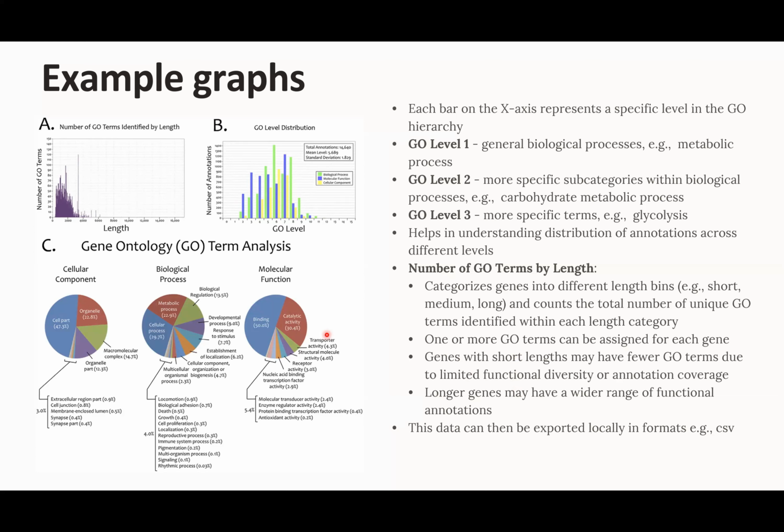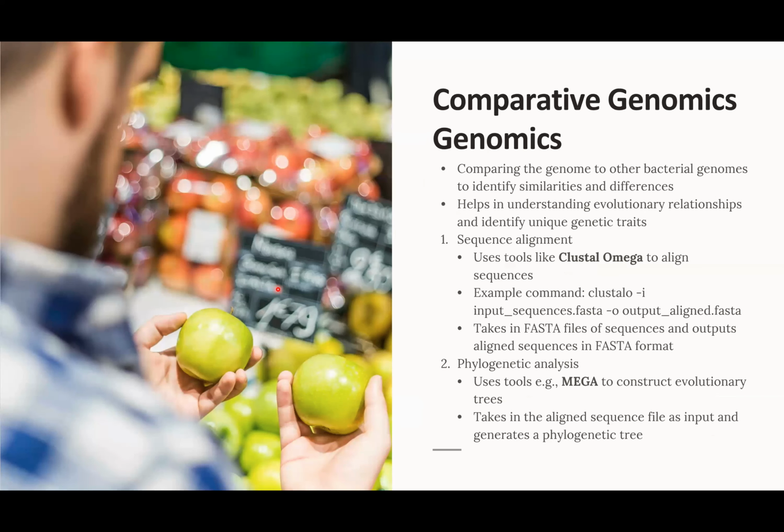And then after that, you can export your data in a format like CSV. Then you can go to the next step, which is comparative genomics. Sorry again for the repetition. I am not sure why my PowerPoint does that.